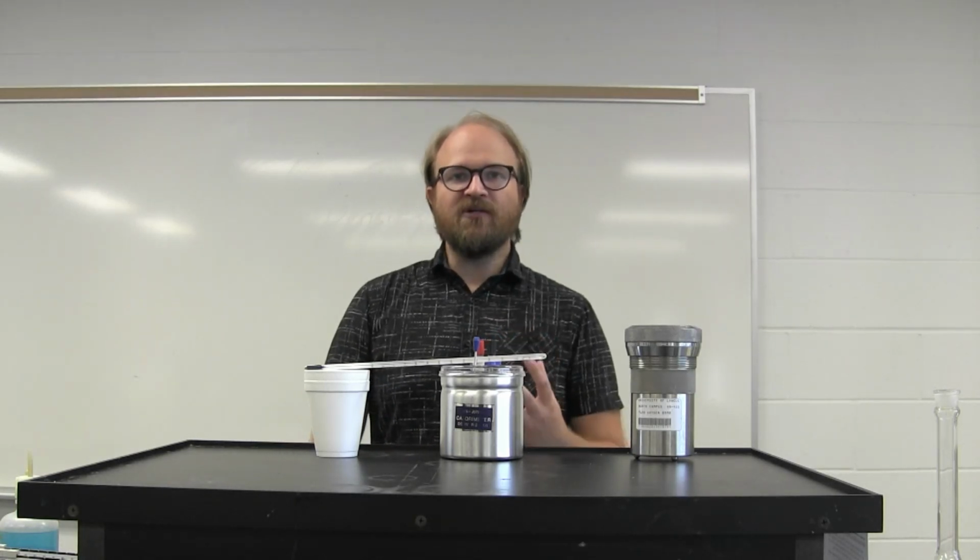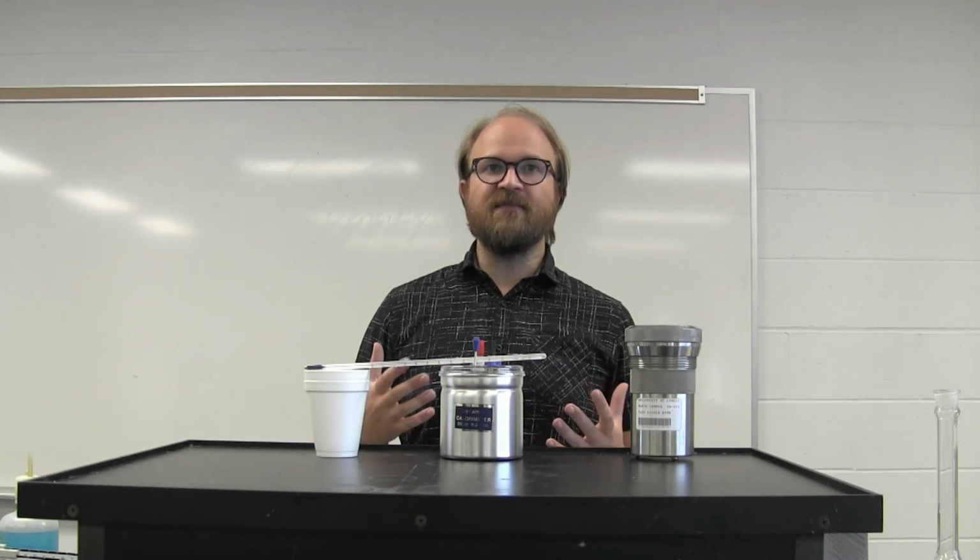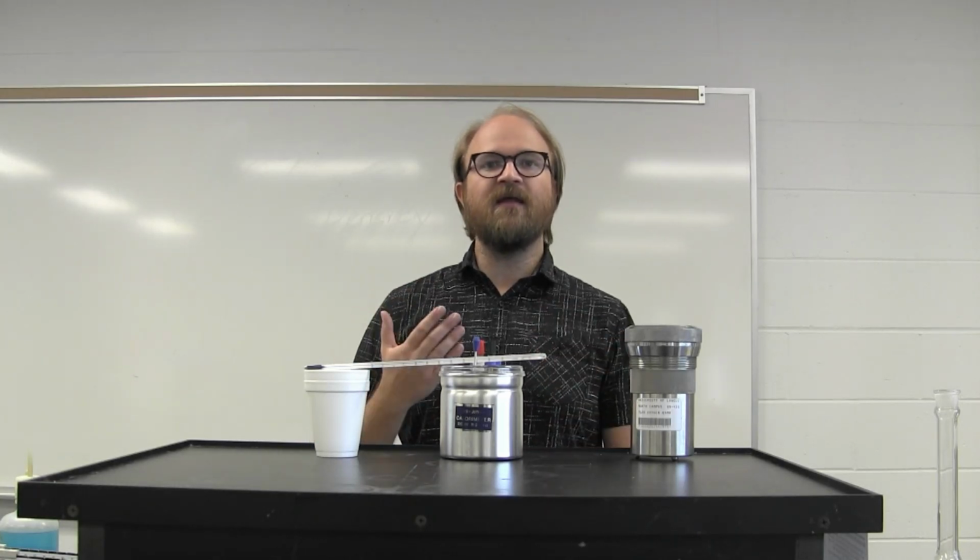There are a number of different types of calorimeters. Some measure the heat associated with a reaction based on a titration or the slow addition of the other reactant. Others scan across a full temperature range to see the difference in energy compared from one substance to another.